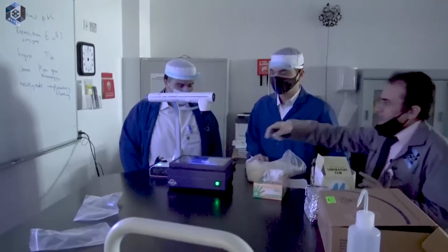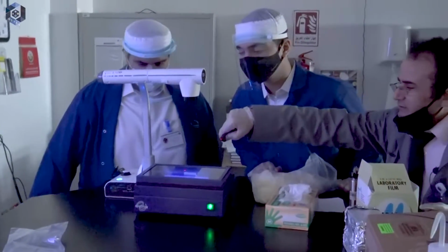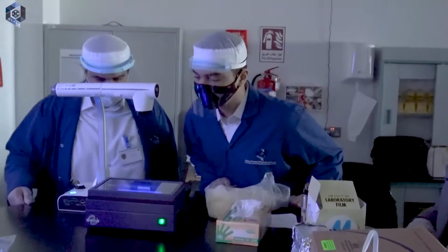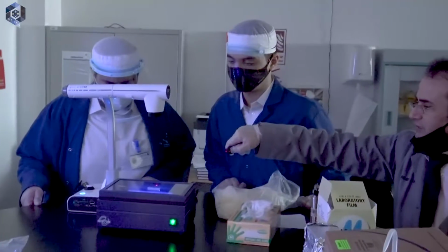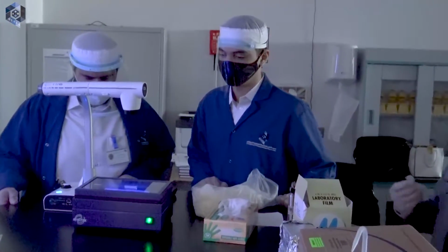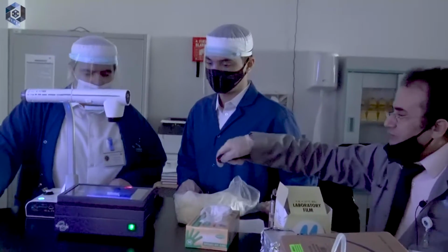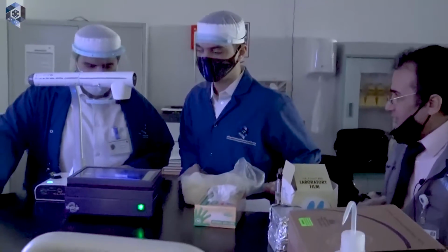Now, can you tell us what these two bands mean? This one and this one. What do these two bands represent? Separated DNA fragments or recombinant DNA plasmid? These two fragments, they are separated. That's why we have two things.